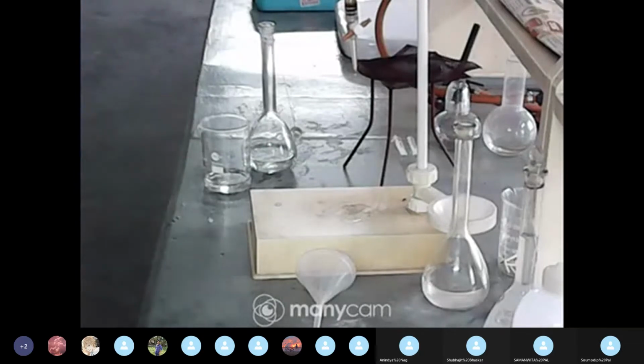When you write it in your lab manual and also during the exam, it will be near to 25. That is, it may vary within the range of 24.7 to 25.2. You must remember that you must not go beyond that range.